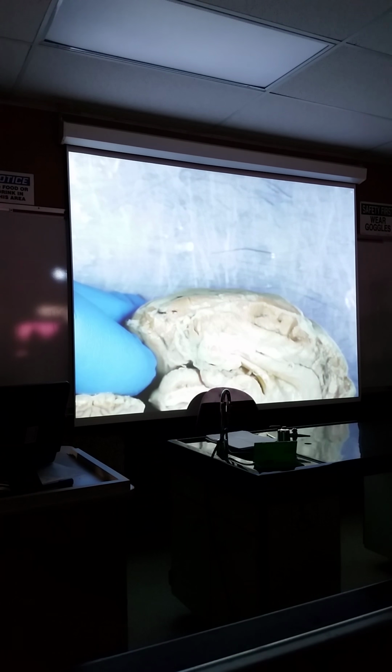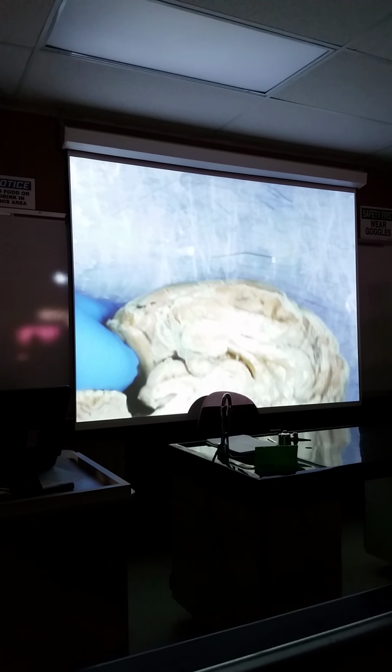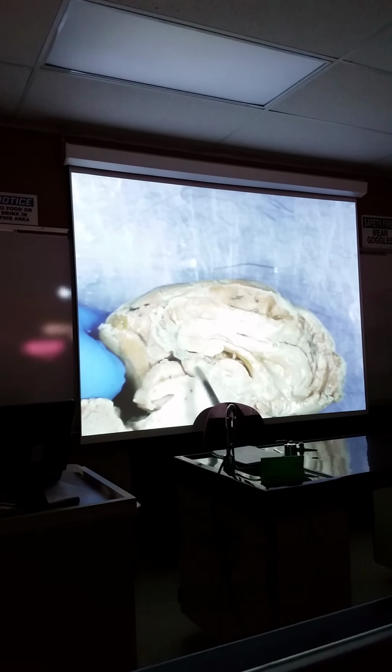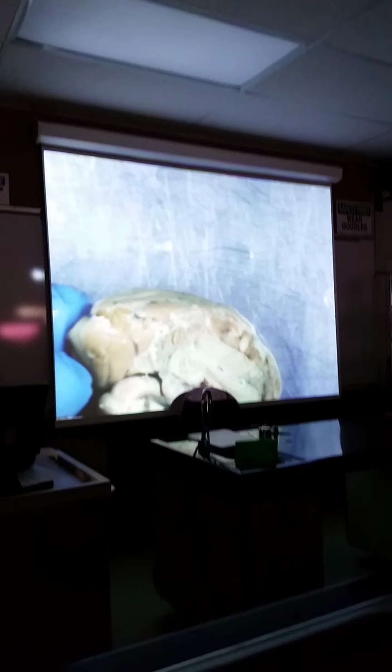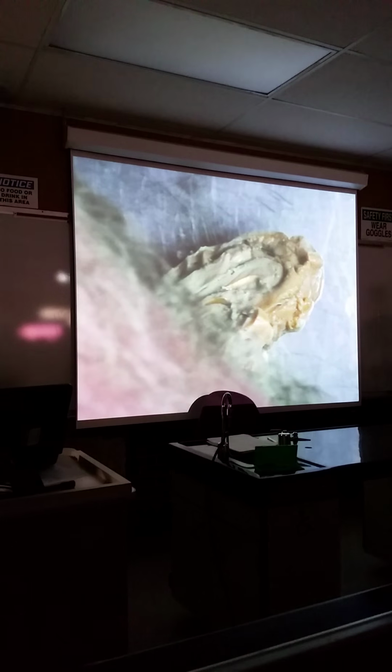Ooh, I didn't mean to do that. I just crushed it a little bit. Try not to crush it. If you crush it, you're not going to be able to see everything. But that's pineal right there. These are the superior and inferior colliculi right there. There's the pineal. There's the interthalamic adhesion. That makes that the thalamus. That makes this the hypothalamus. There is no pituitary hanging off of here because it's right here.